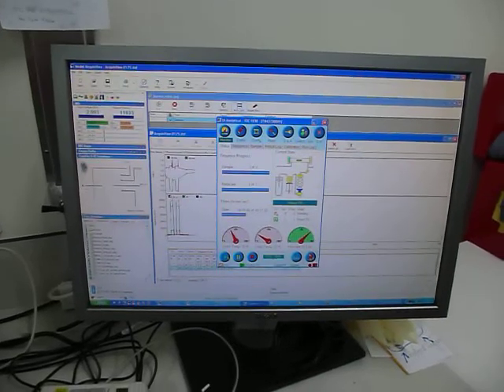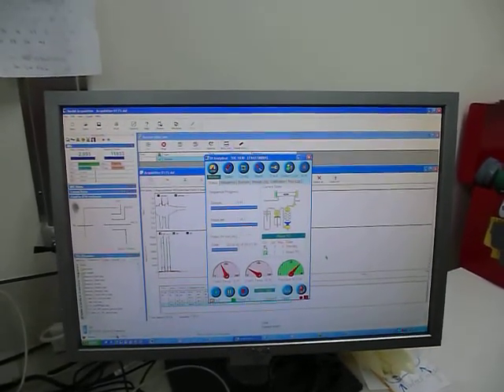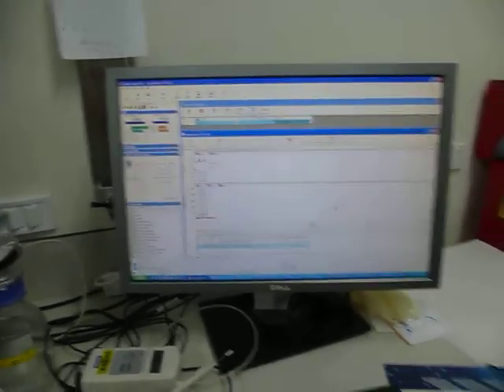The script now is in a sleep or waiting mode, so some time later it will do something else. It's okay if I change the focus to this window. So there are two reference peaks here. This is the way the isotope measurements work, so I won't explain everything. Those are not the sample peaks. This is what matters now.